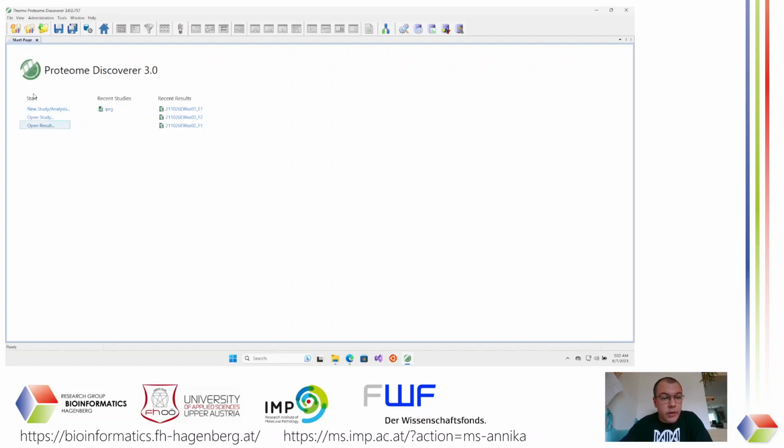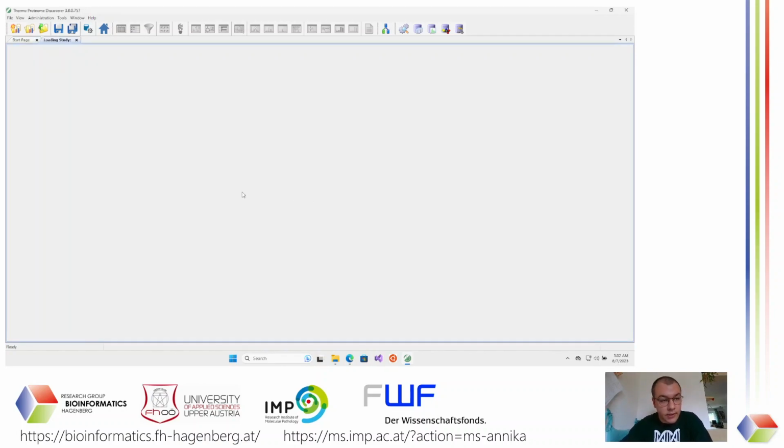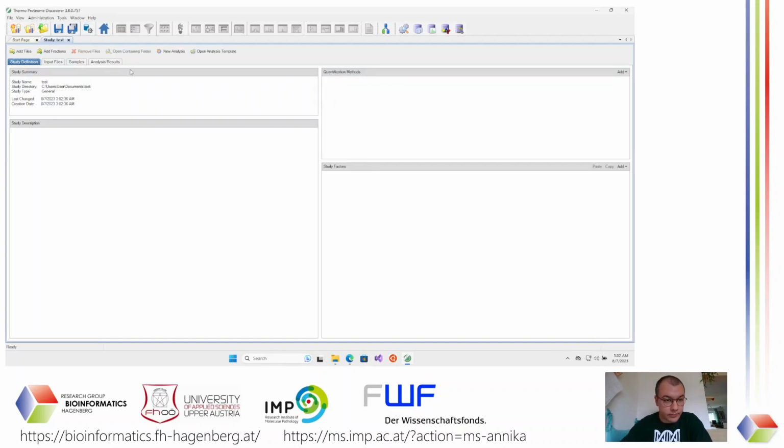So what we are going to do now, after we opened Proteome Discoverer, is define a new study where we are going to do our analysis. For the sake of this video, I'm just going to call this test. And now it creates a new study for us.